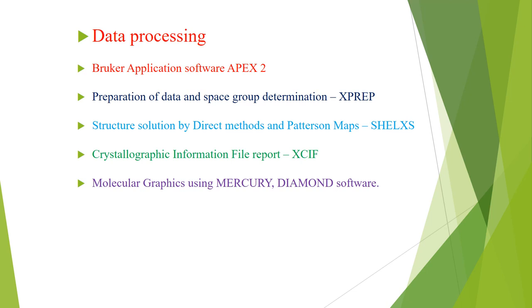After that diffraction pattern, there comes some data processing software which is present in a computer. That computer is also attached to the X-ray diffraction machine. So here are some kinds of software that process all that data to generate structural information about the single crystal.